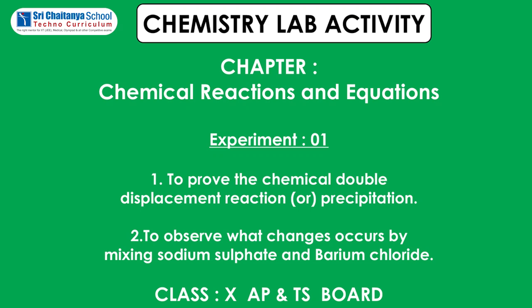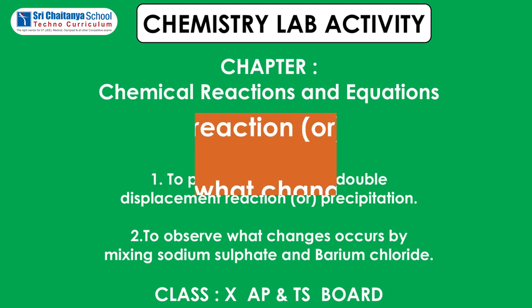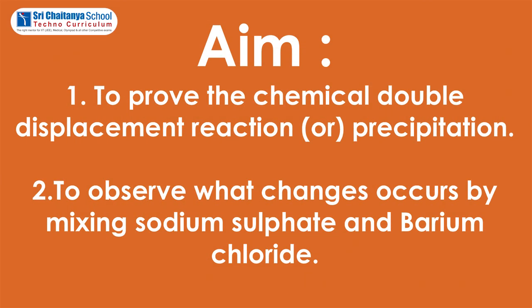Hi children, now we are going to do an activity. This activity is from the lesson chemical reactions and equations. The aim of this experiment is to prove the chemical double displacement reaction or precipitation, and to observe what changes occur by mixing sodium sulfate and barium chloride.